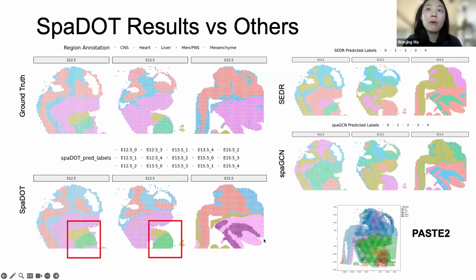I do notice that we obtain a certain region split here, and that is basically caused by the number decrease, because in the original one they also think they detect certain liver, but I don't think that's the truth, because as you can tell, the liver is the green dots and it spreads all over the place, and I don't believe that's the true liver organ.